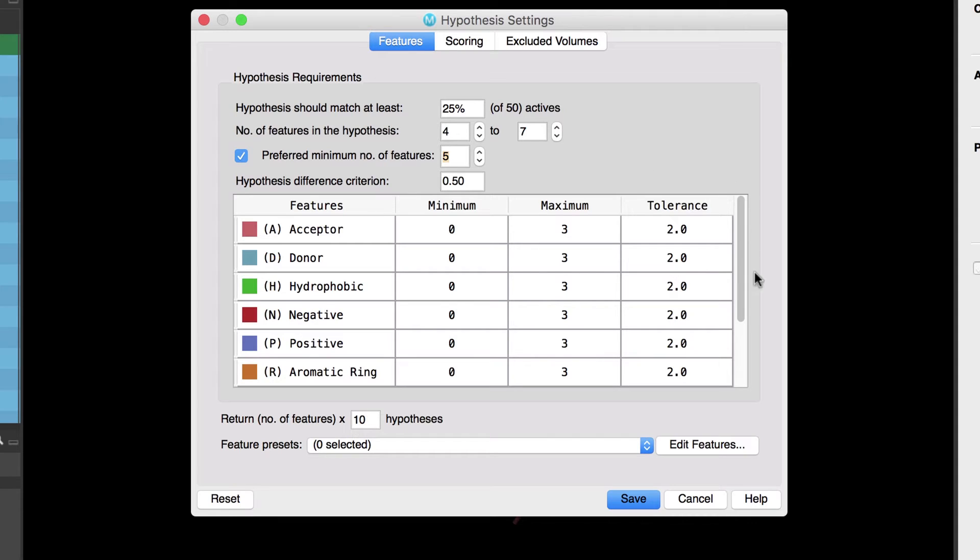For all other feature settings we'll just use the defaults but as always you can click the help button to find out more information about a given setting in the panel.